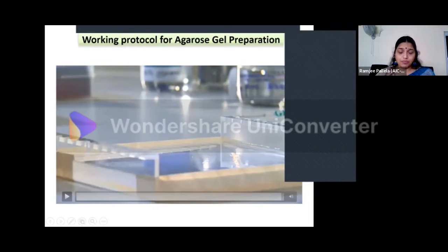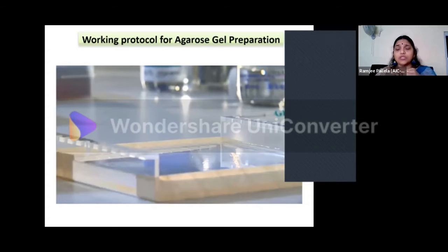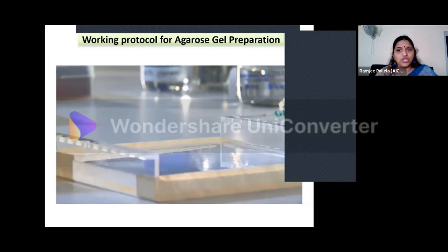This is a crucial step. When you are removing the comb, be patient. Slowly remove the comb. You may have to slightly move it from the sides and then remove it, because if your wells are actually damaged, then the movement of your DNA will be lost. You will not get a clear sharp band. You will get very haphazard bands, U-shaped, V-shaped, sometimes W-shaped.